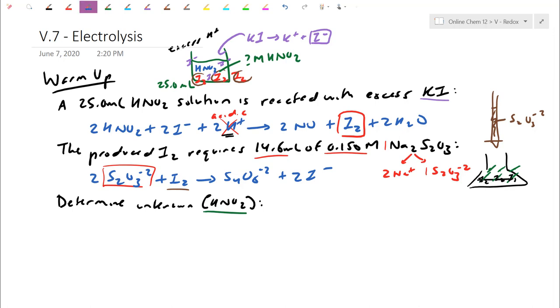Yesterday, I sort of alluded to this: I2 itself already has a sort of purplish, even brownish kind of undertone. Usually what you would do is you throw in a starch indicator, because starch and iodine actually turns out to be a really, really deep blue color. When they describe this procedure, usually it's like, oh, toss in a little bit of thiosulfate first and then add the starch later. I just tell people to just throw in the starch right away.